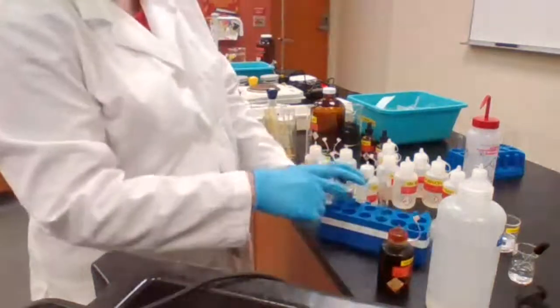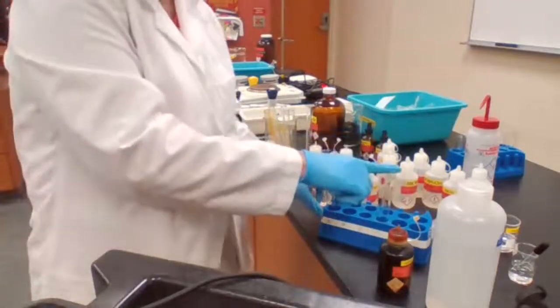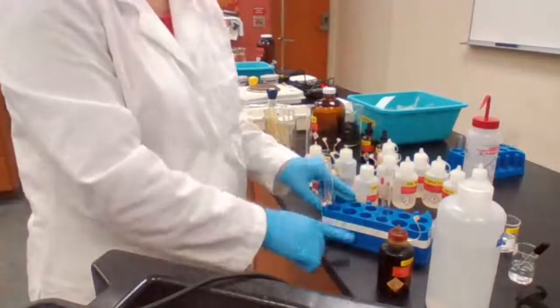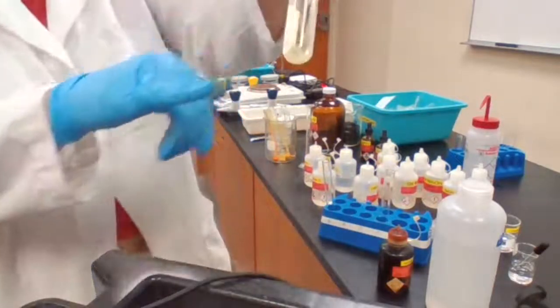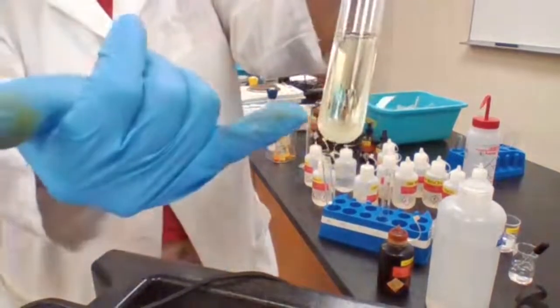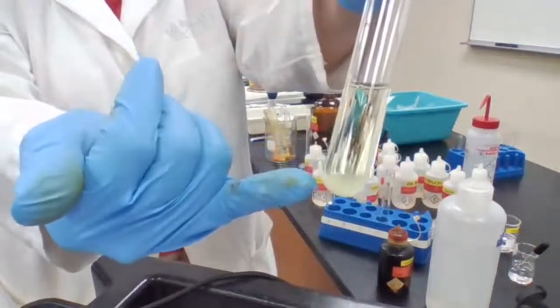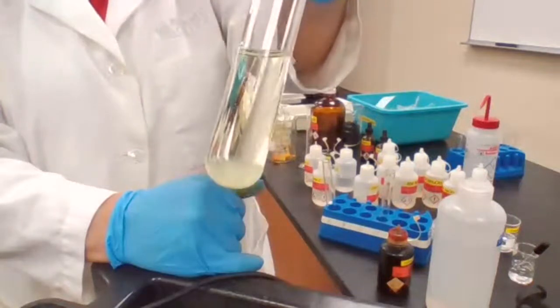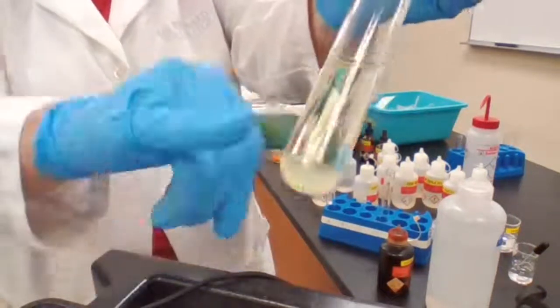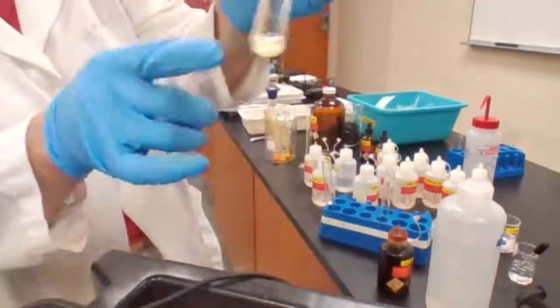For the last, for iodoform, A was negative, D was negative, but C was positive. And the positive C, it's this. This is the positive C because we have a cloudy solution here. That means a precipitate has formed. That's C. That is positive. Okay, the precipitate that forms here is bright yellow, yes, it is a yellow color here.